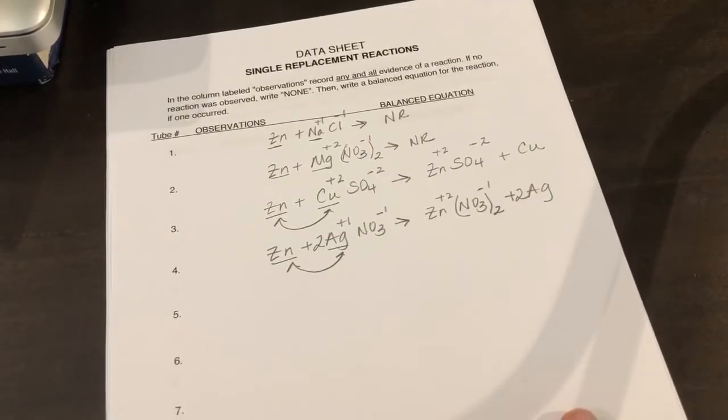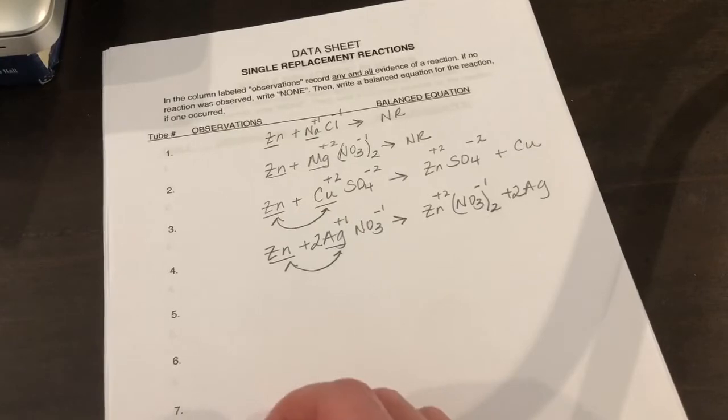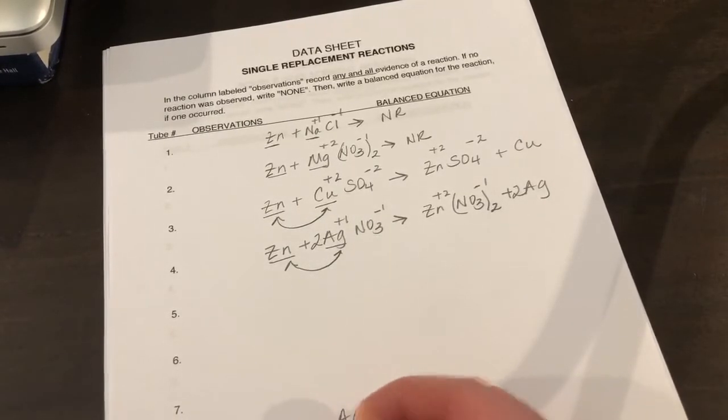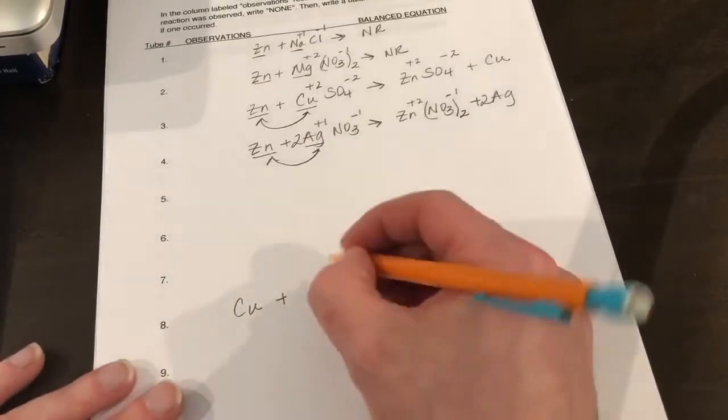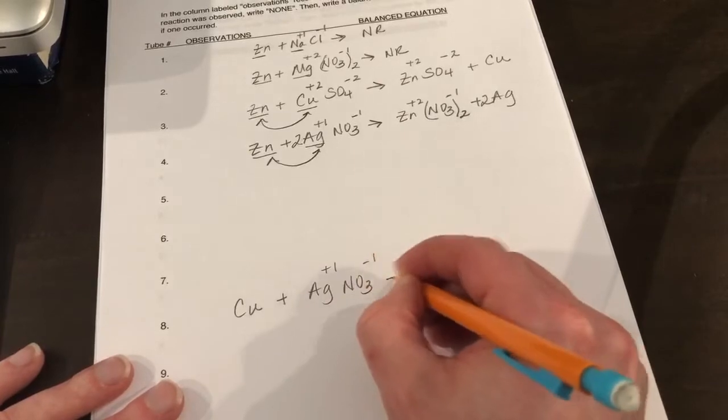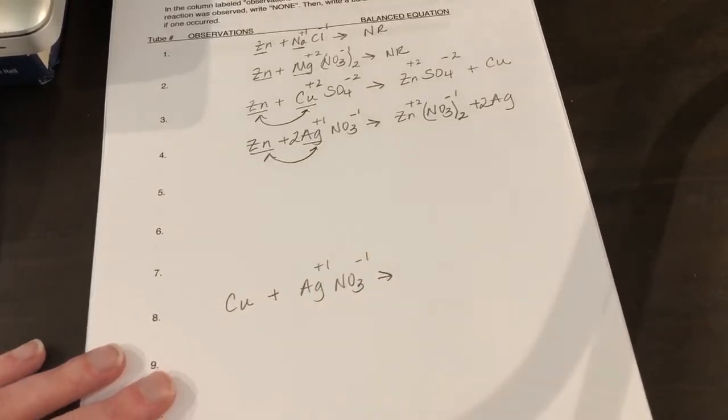So on number 8, it said we're going to do solid copper plus 5 milliliters of silver nitrate solution. So copper is Cu. Silver nitrate is Ag with a +1 charge. NO3 is a -1 charge. They're equal and opposite, so we don't have to crisscross.